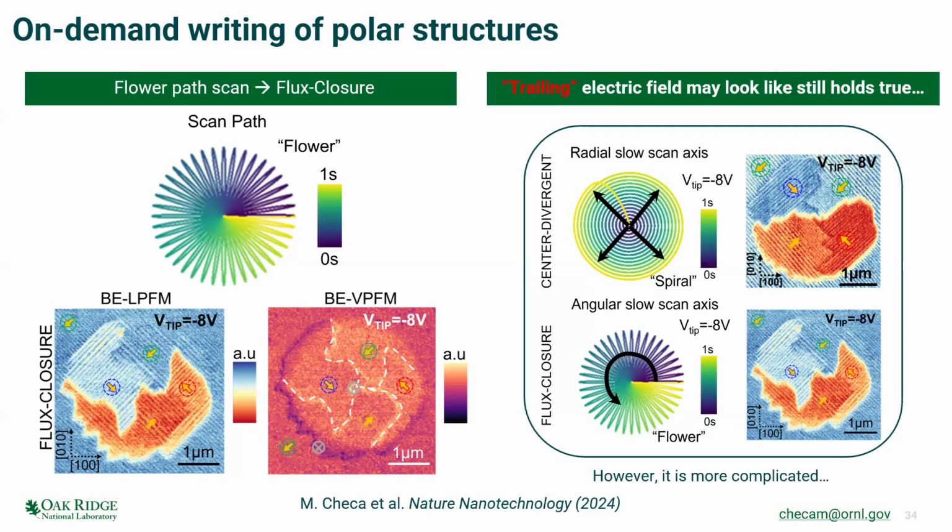Okay, one more question, and then we close. Just a random thought: on-demand patterns to create this topology, but there you apply the electric field through the tip. I'm wondering, have you ever tried no applied electric field, but using a harder tip? It's on the to-do list. Mechanical scan-path-dependent writing, to get something similar. Yeah, we can talk about it.